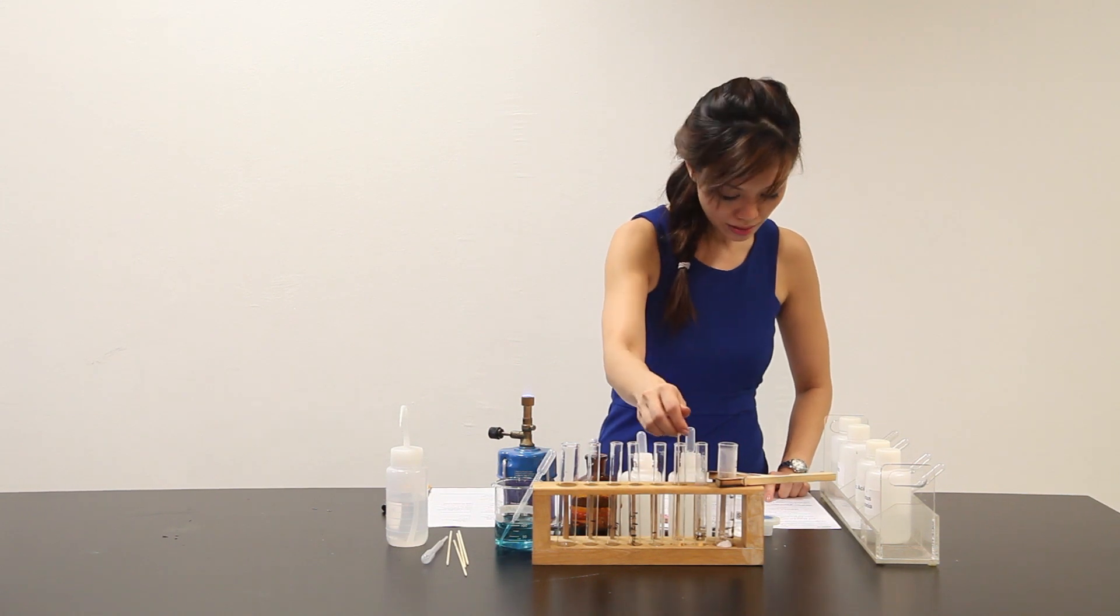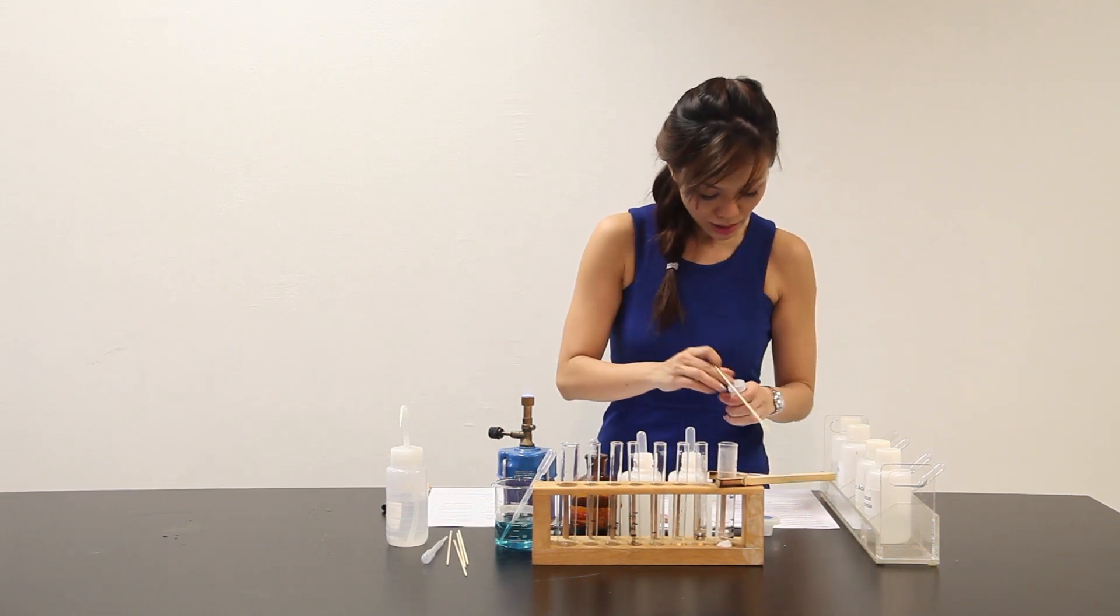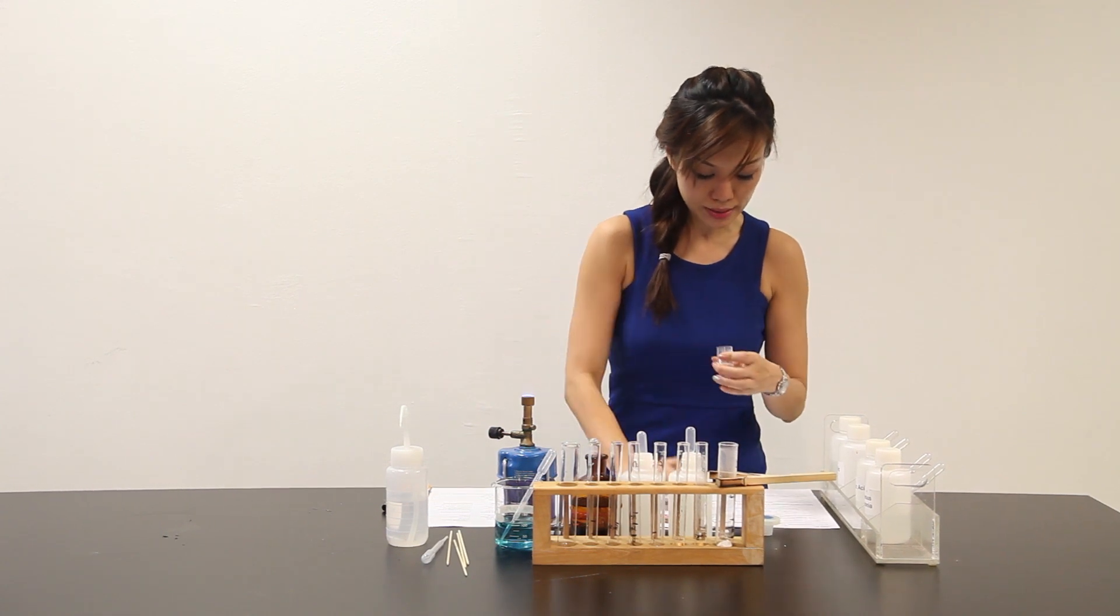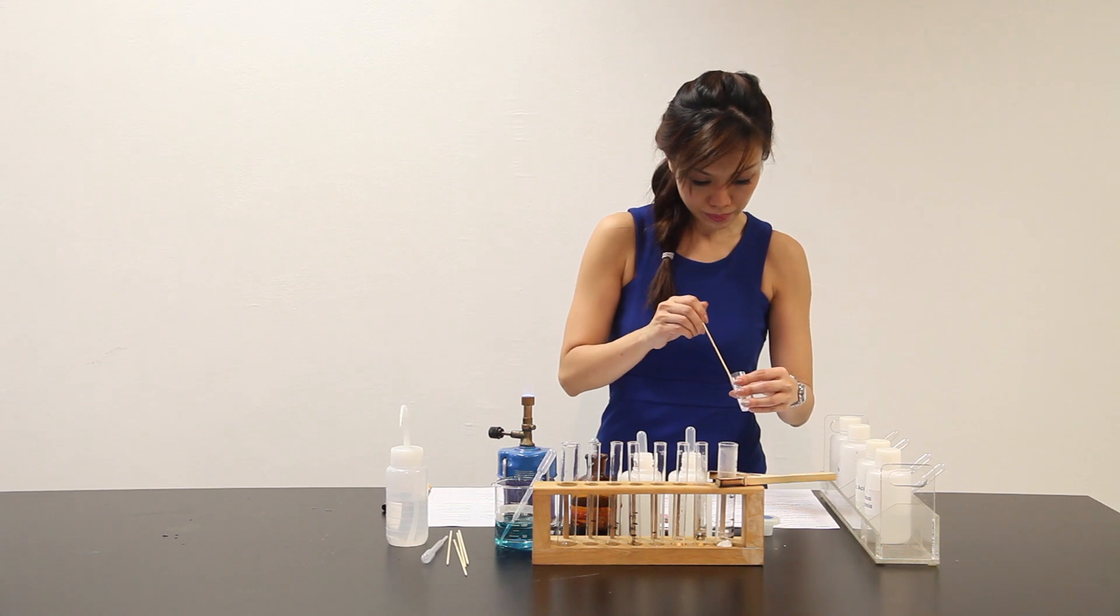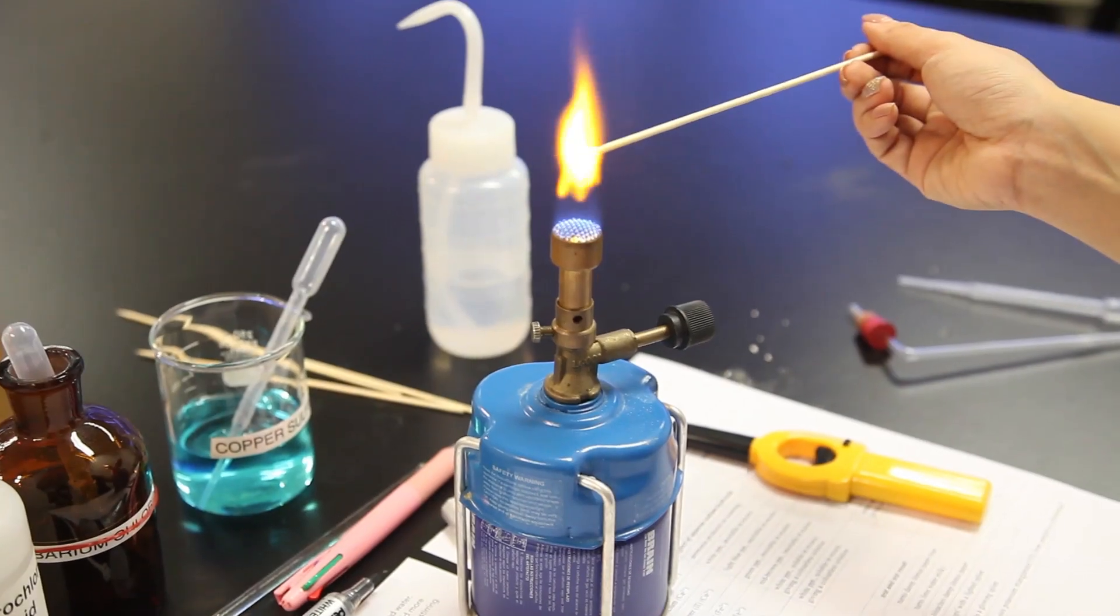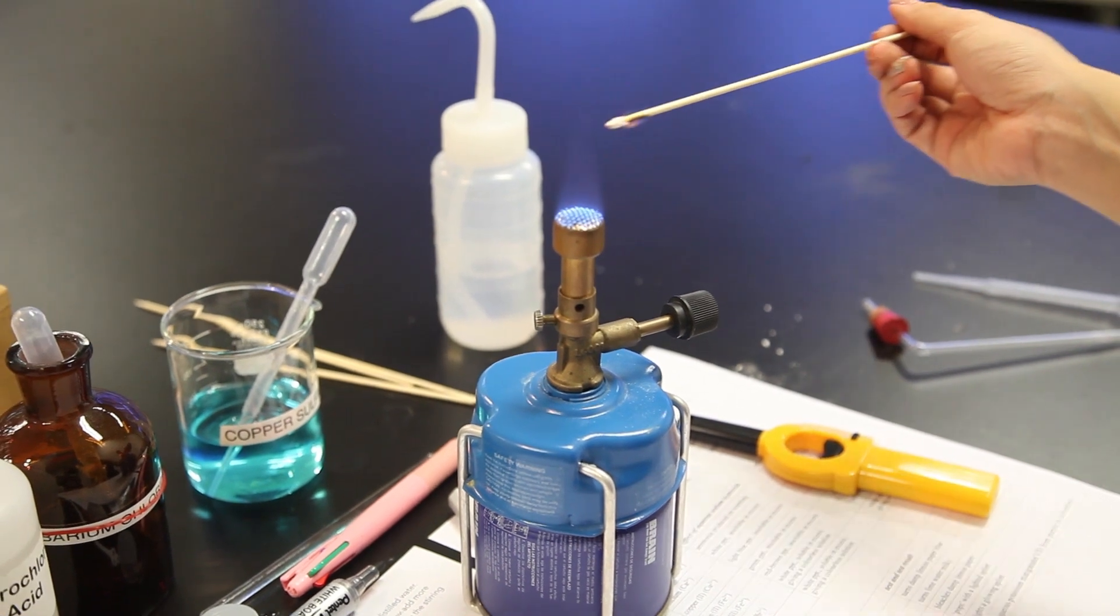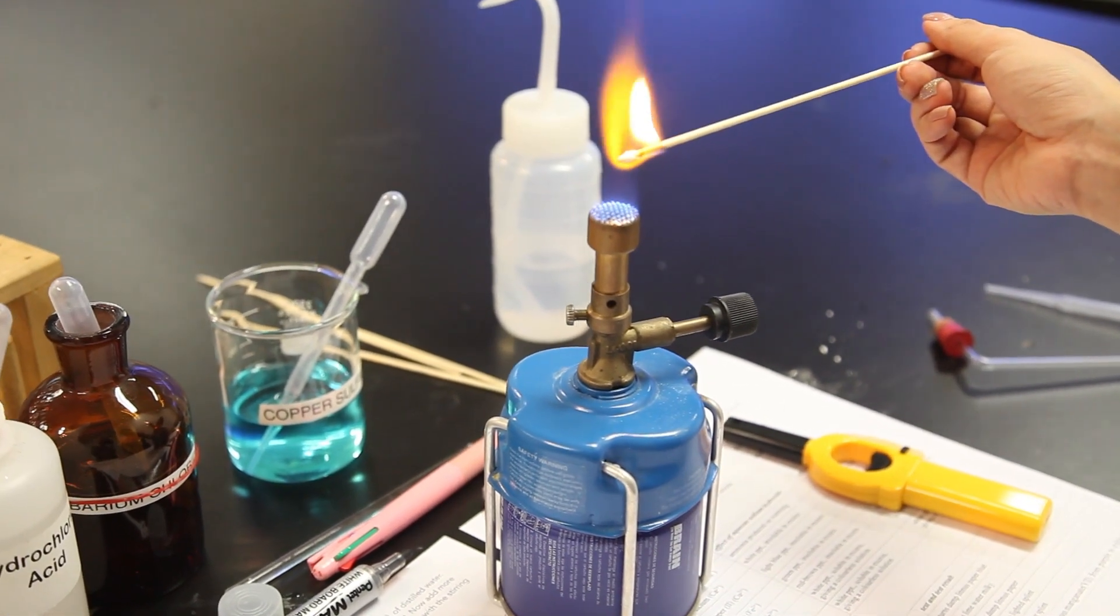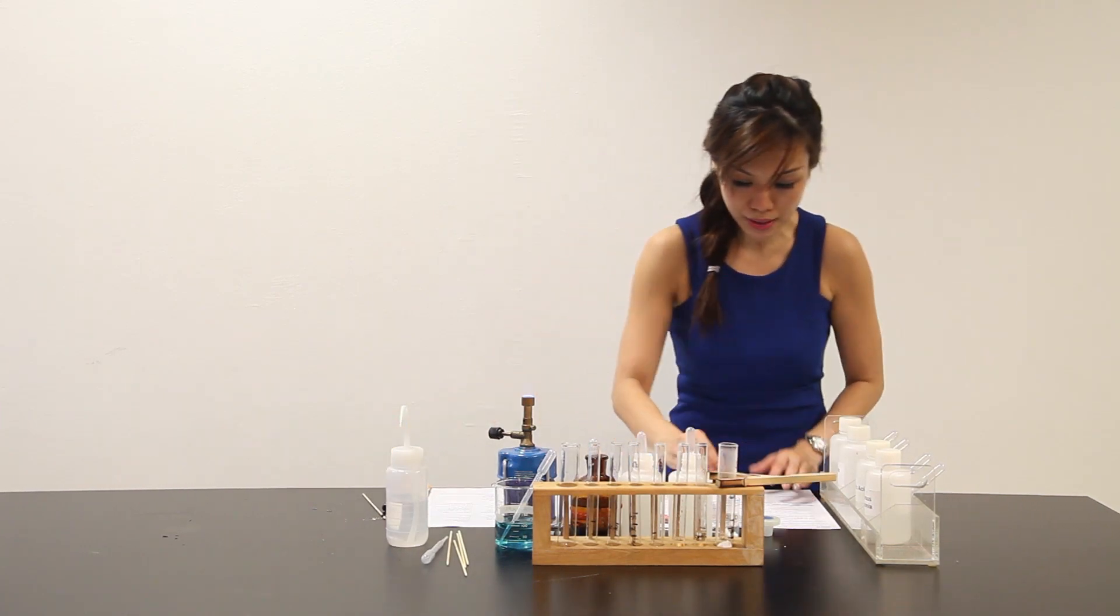Moisten the end of the wooden splint with water and dip this into sample solid X. And place this end in the Bunsen burner. And I can see over here that an orange flame is observed. So, let me write down the observation. An orangey flame is observed.